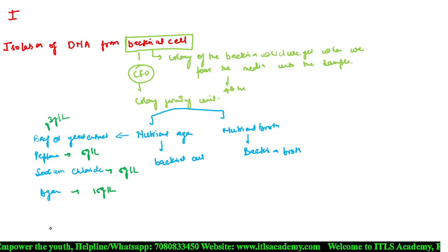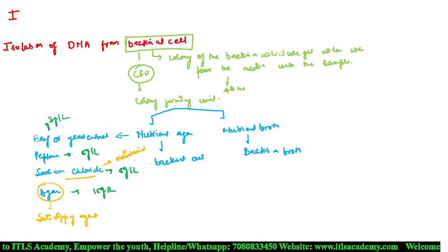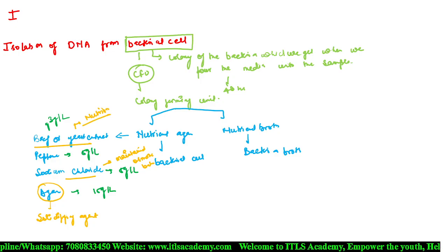This agar acts as a solidifying agent. Sodium chloride is used to maintain the osmotic balance, and it is used to provide the nutrition. Okay, so this is not a part of your curriculum, but I just tell you.